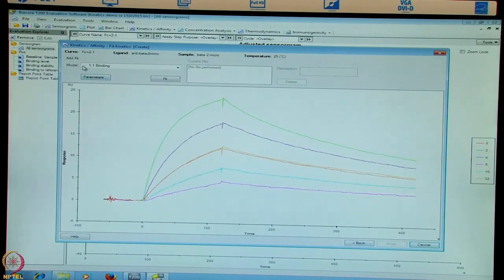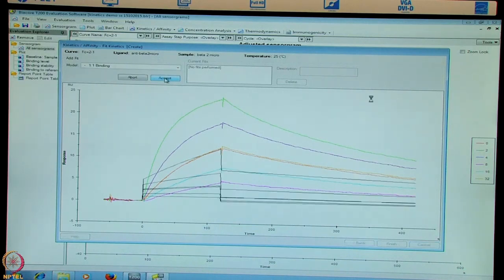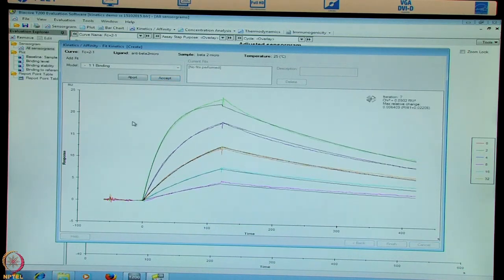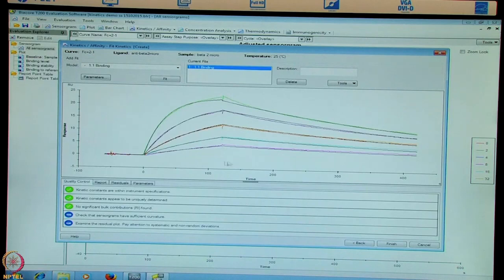Now you see here one-to-one binding and parameters here, fit here. So we could place mouse on the fit and press start. So data is fit with the black lines superimposing on the colored lines. And the following information is generated. If you see the quality control tab, report tab, the residuals tab, and parameters.